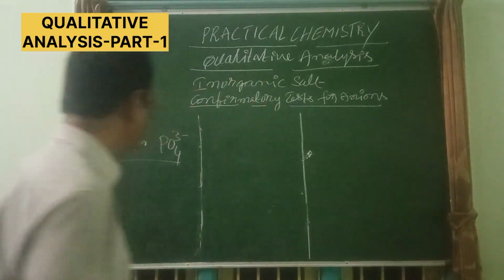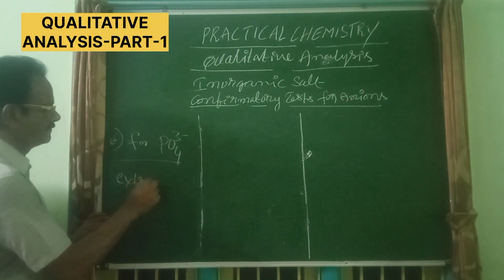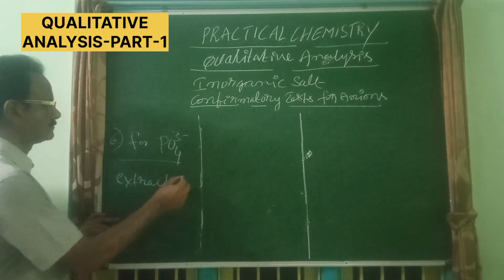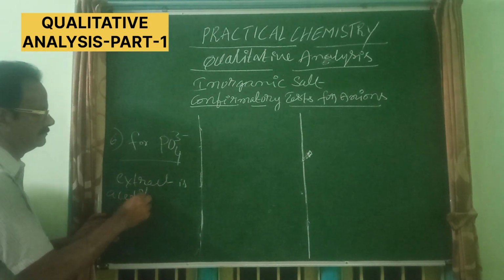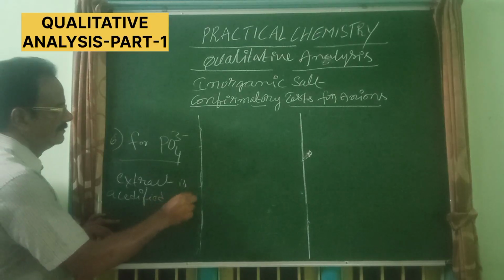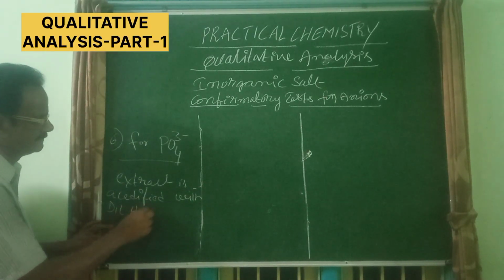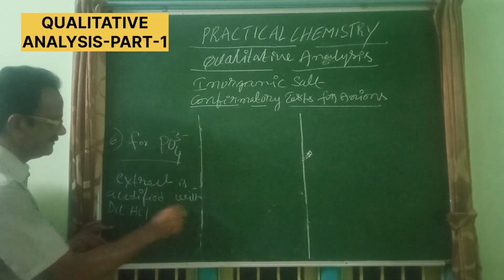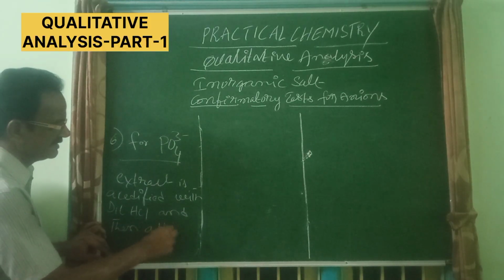So here the extract is acidified with dilute HCl and then added with magnesia.